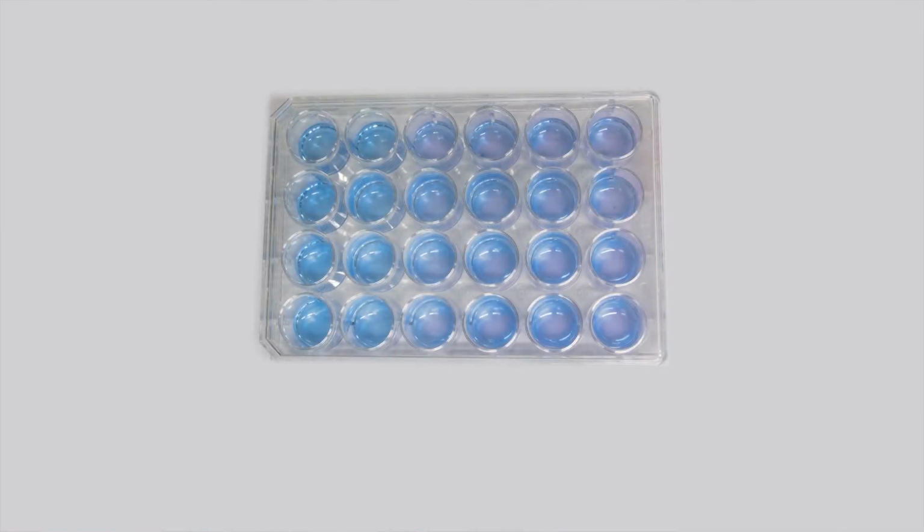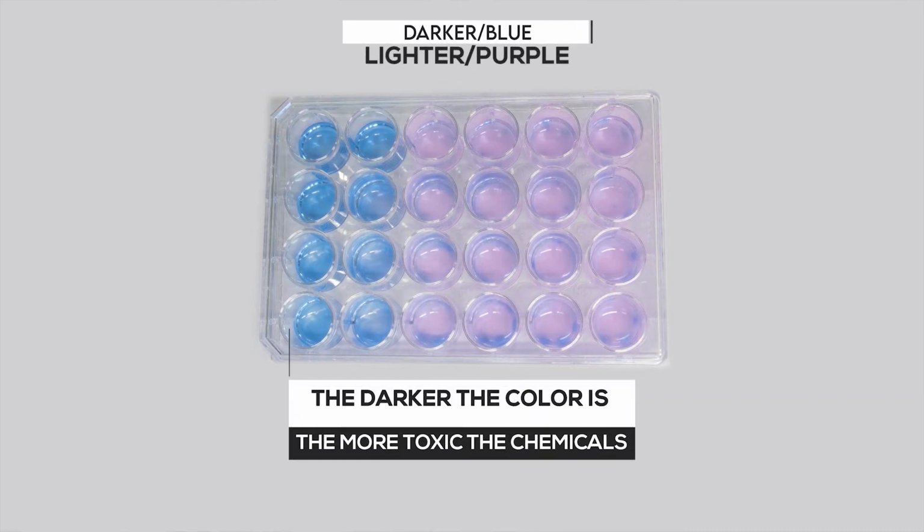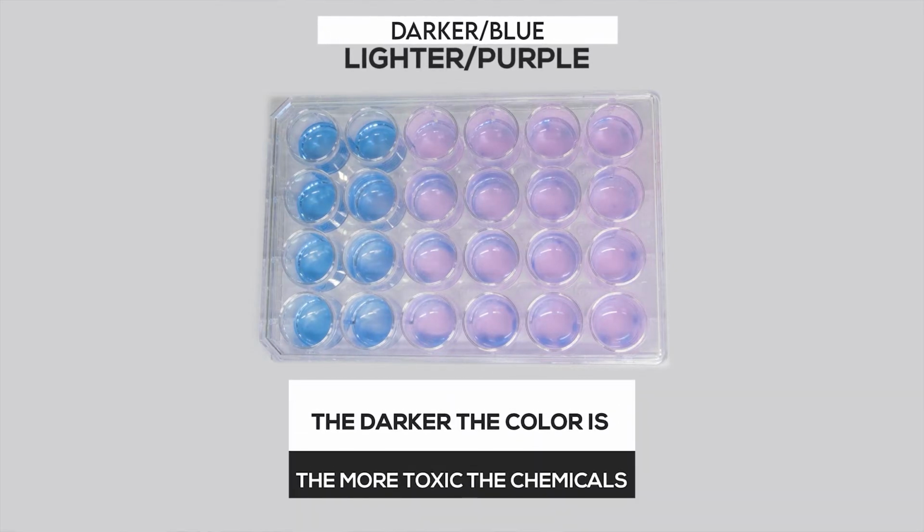Now, for this, we came up with a solution that we use colored dyes, which basically indicate the viability of these cells. And it's very simple. For some of them, you can even see this by eye. So basically, the darker the color, the more toxic the chemical. So after all these developments, we were finally able to do our proof of concept study.